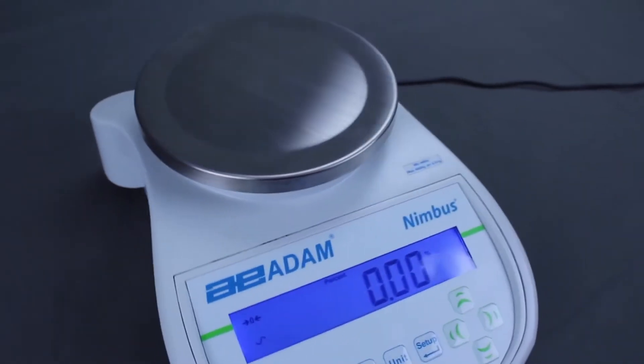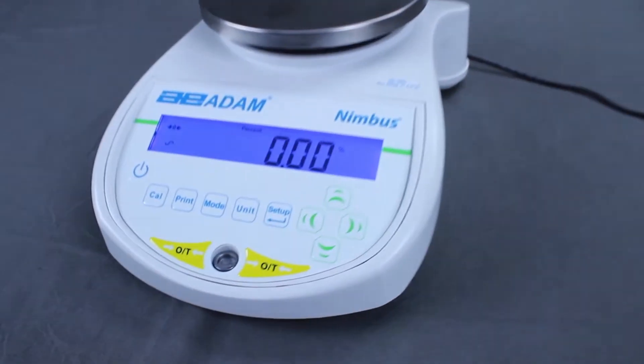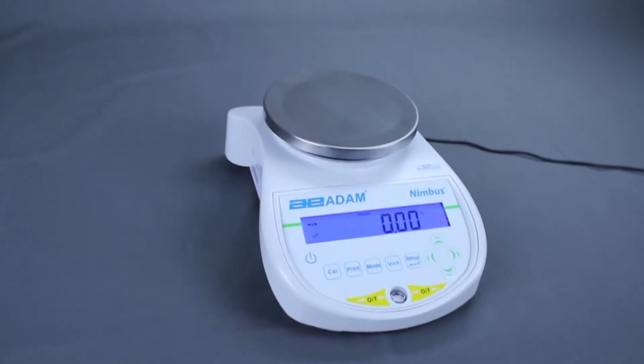Welcome to ADAM Equipment's Percentage Weighing Overview. This video will demonstrate how to perform percentage weighing with the ADAM Nimbus Balance.